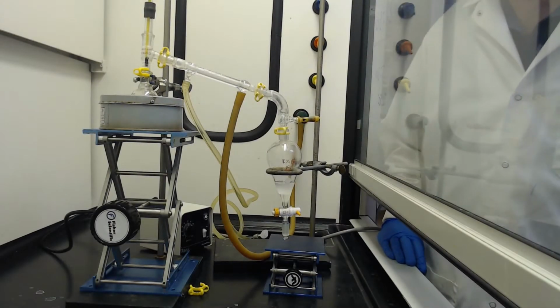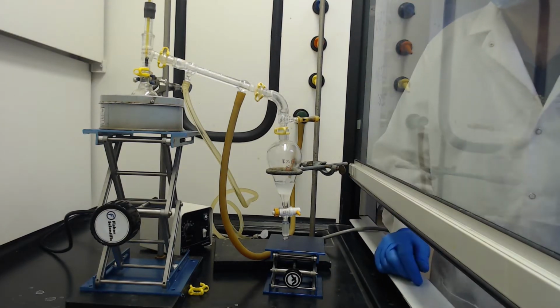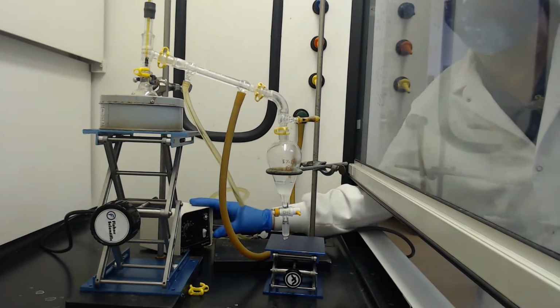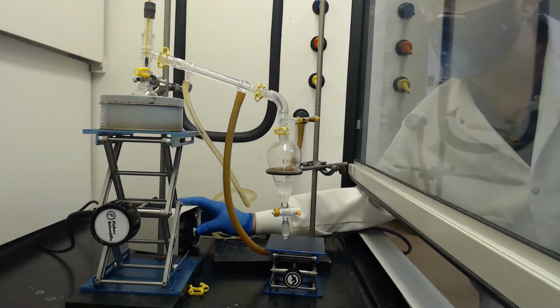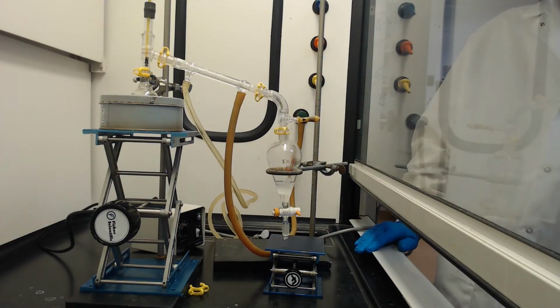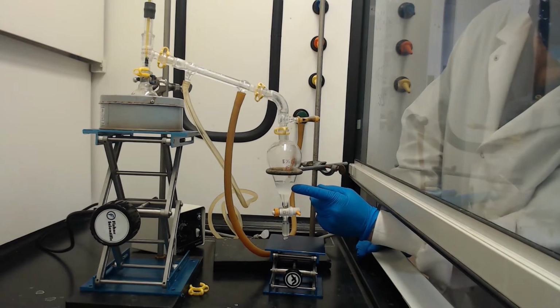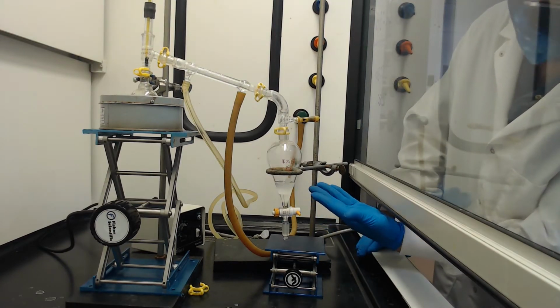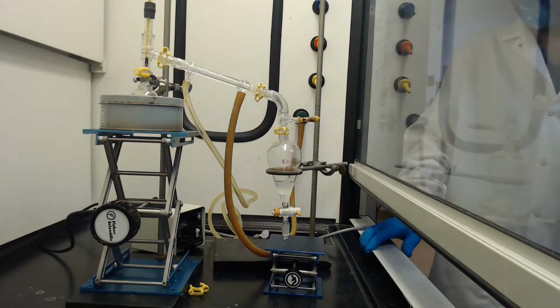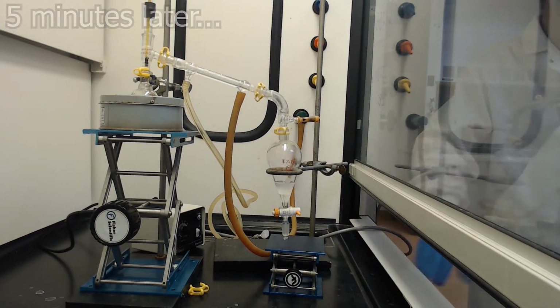So as this thing is rolling up, it's about 95 degrees, and we're going to stop the distillation. We're going to turn off our variac here, and we're going to let this cool down a little bit from the 95. And we see we've collected, it's biphasic. We have the water on the bottom, the top, assuming, is the organic based on densities. And so we'll let this apparatus cool off, and then we'll do the workup here.